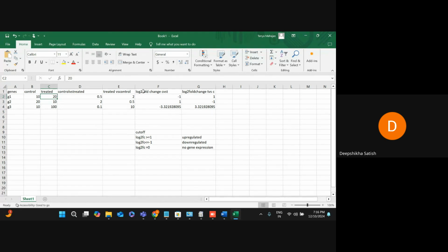So in this biological analysis plan, this log 2 fold change value is very important. So did you get this? What are the standard cutoffs? Because in the data analysis we are going to see this. Okay, is it clear why we are calculating this? These cutoff values we only apply for the treated versus control, no? No, ma'am, it depends on your data. These are standard cutoffs for any plan. But depending on your data, we can also shift the cutoff.